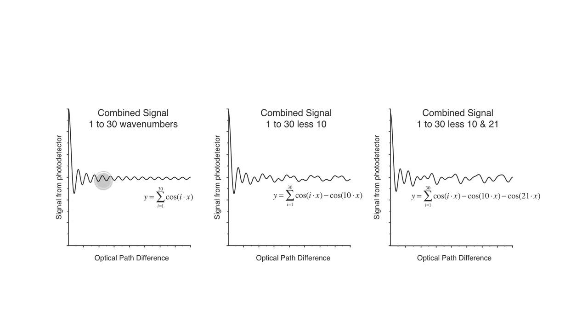And then look how quickly it settles down. This region here is where the information is. I mean, all of it has the information, but this is going to just go on forever. As long as your instrument doesn't have too great of a noise, you'll be able to see that signal for a good long time, and you'll be able to measure it.